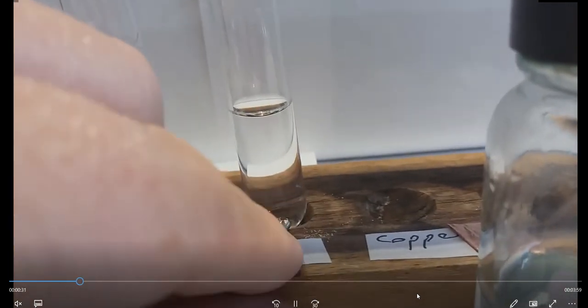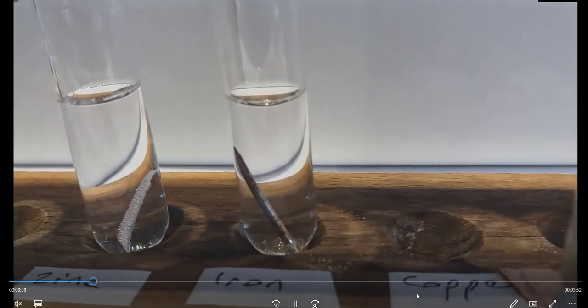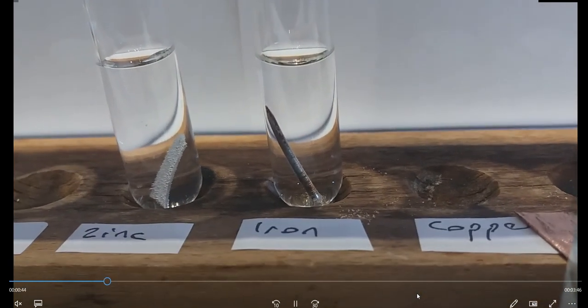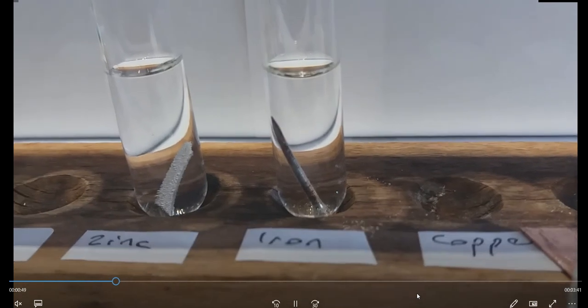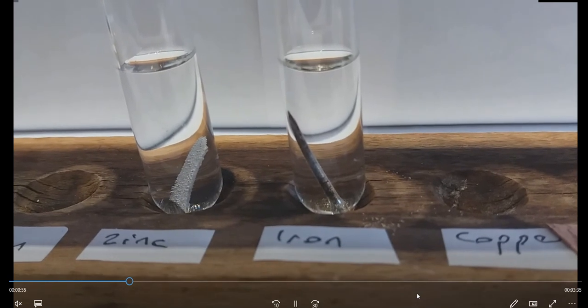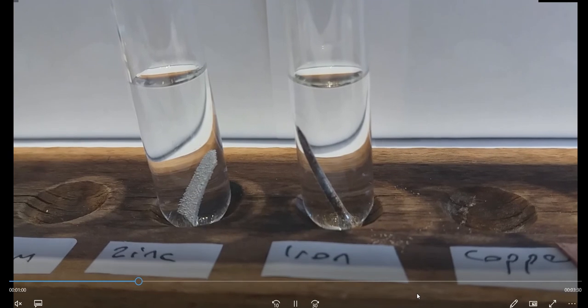And to show iron, I've got a little iron nail, and you'll see it's definitely an iron nail. Lots of nails are protected and so on. I had to get one that was a wee bit rusty. That's one that's definitely iron. And when it goes in, again, it doesn't appear to react very much at first. But if you look closely at both of them now, you'll see bubbles start to form over the surface. Those bubbles are hydrogen. So that's showing that those metals are reacting with sulfuric acid.